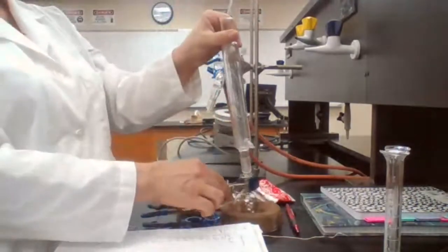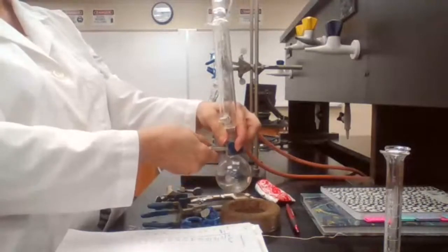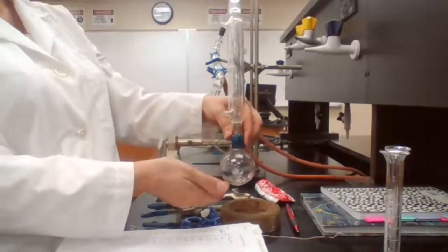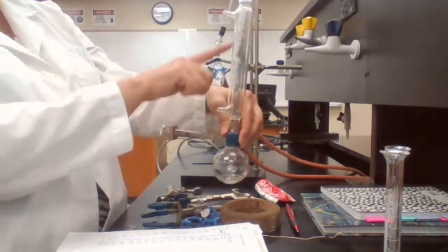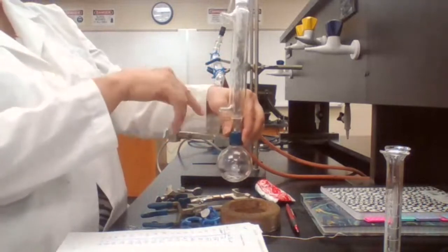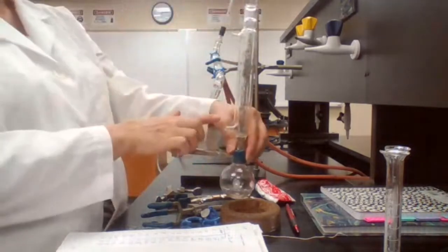The vapor, as it comes into the condenser here, is going to contact this steel wool as kind of an obstacle, so it doesn't go straight up, it's not open.